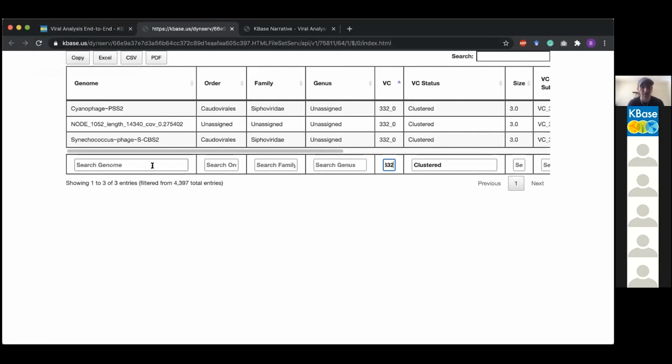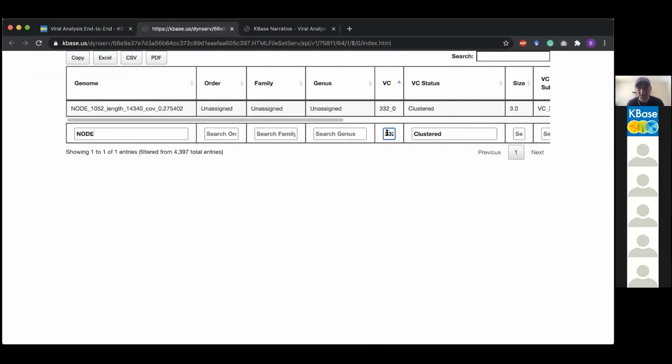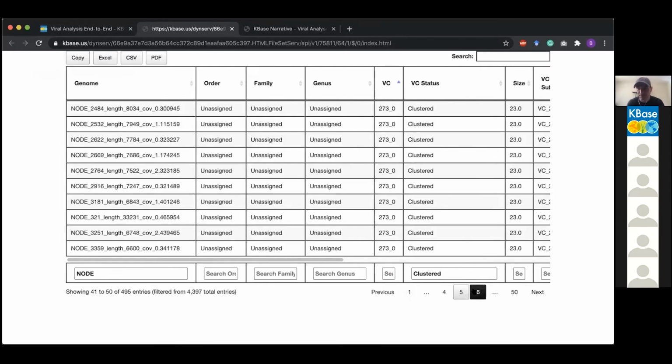You can do this with lots of other data sets. Unfortunately, I wish I would have kept my spot. You can go through, yes, there's 50 of them. I am trying to figure out ways of making this a little bit faster and easier. I would very much like for it to already break it down for you, but it's all funding and developer time and all the effort to make it as easy for the user as possible in order to process this data set.